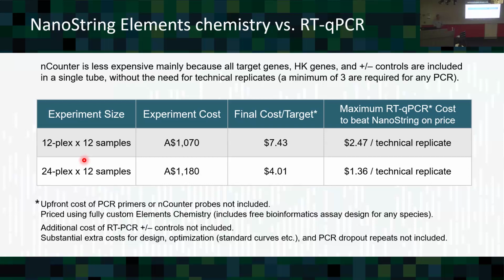You can confirm that, but they'll do a lot of this kind of bioinformatics, some pretty fancy bioinformatics. Other examples are people have said, I want to design a probe set that will work in mouse and in human, or in all non-human primates, for example. And there are examples in xenograft situations where you want to detect the mouse and also the human variant of that gene. So there's some crazy things. You just specify all this and then they'll go away and design it. And they'll come back and talk to you about it if they have any problems.